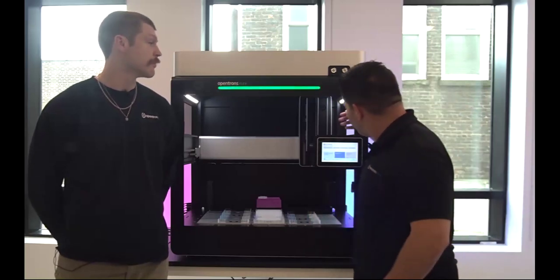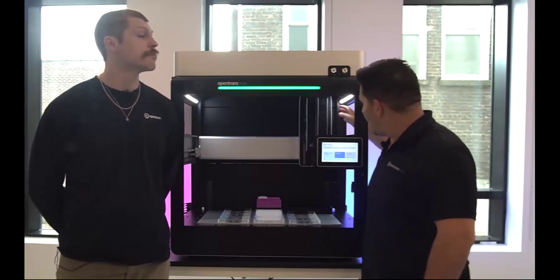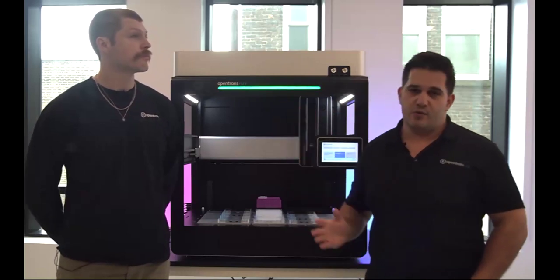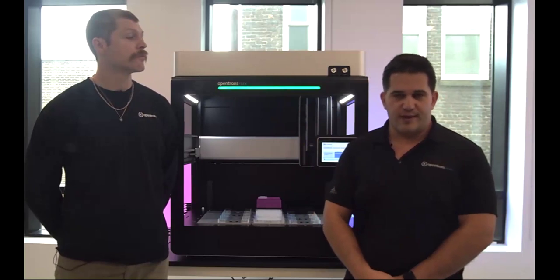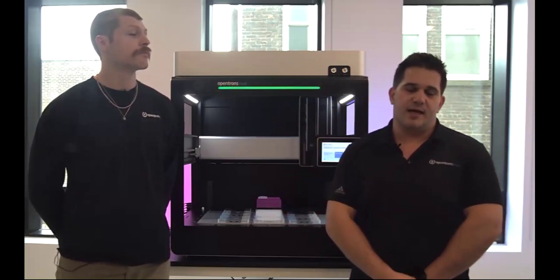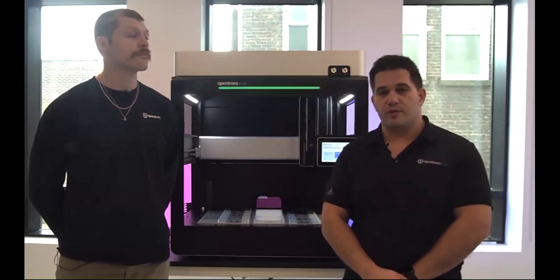Now the gripper sits off to the right of where the pipettes would go. So no matter what pipette configuration you have on the robot, you can always have the gripper there. So to answer the question in short, yes, you can have a 96 channel pipette and a gripper at the same time, working in conjunction to do higher throughput workflows.